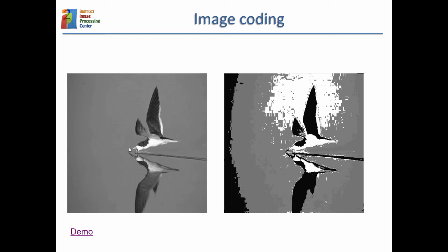When you go to only 4 colors along the range, now you really see the differences. And now this is a binary image where you have only 2 colors, 0 or 255. And the take-home message is that by controlling the number of bits, you can control the representation depth, so how accurate your intensity representation is.